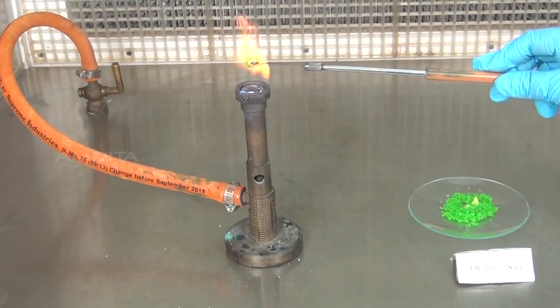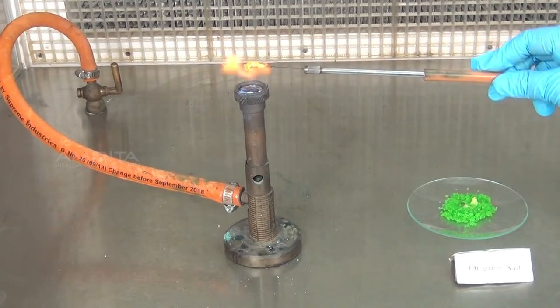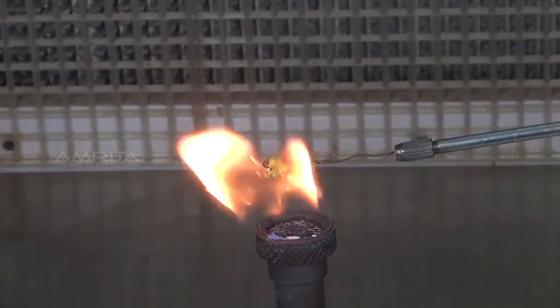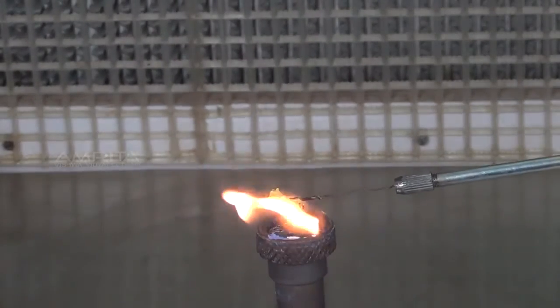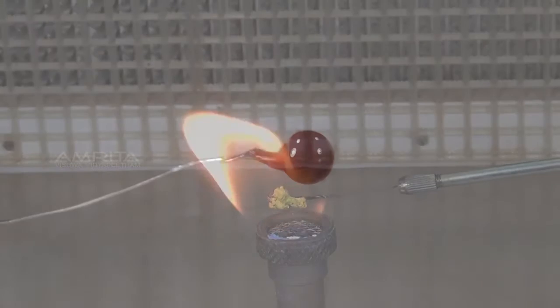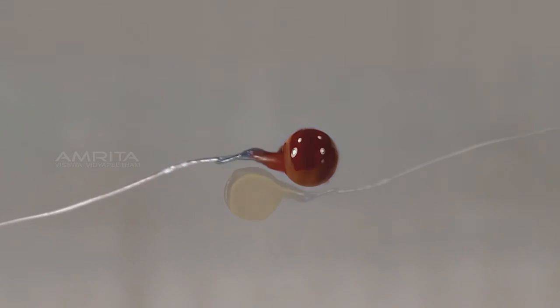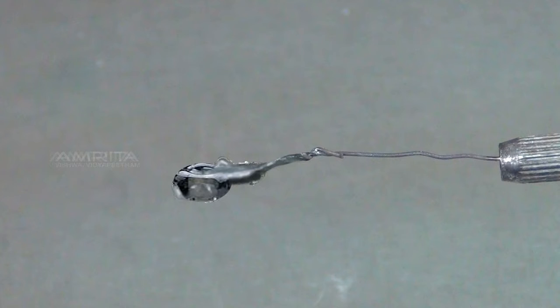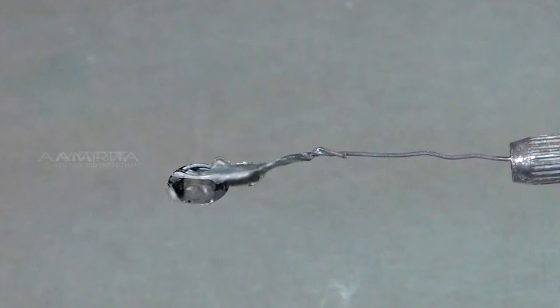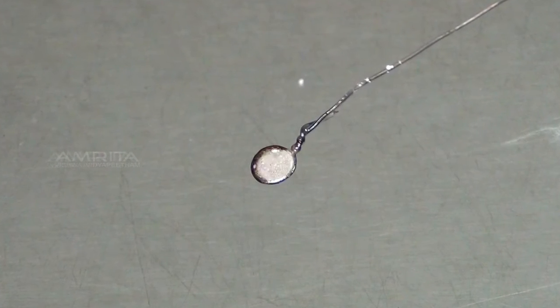Heat it again either in the oxidizing flame or in the reducing flame of the Bunsen burner. In the oxidizing flame, the color of the bead becomes brown when hot and pale brown when cold. In reducing flame, the bead becomes grey when hot and opaque when cold.